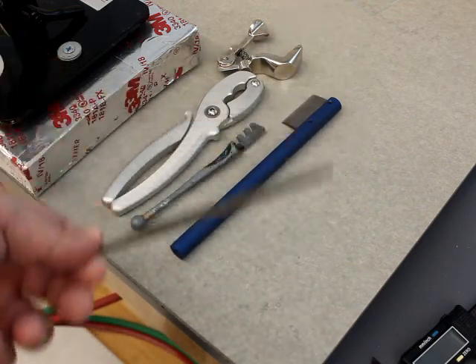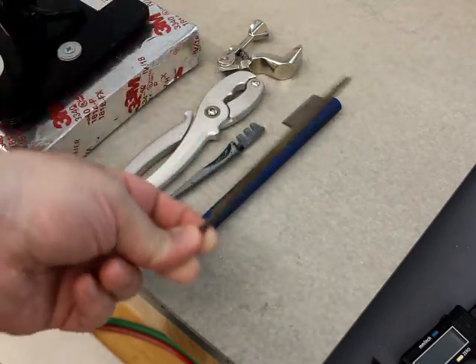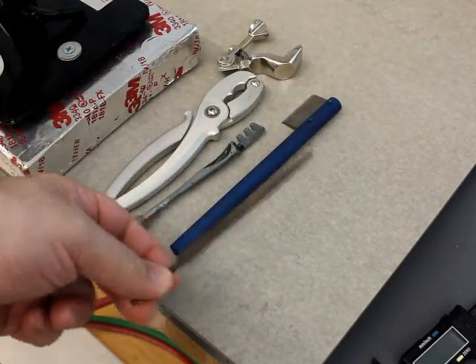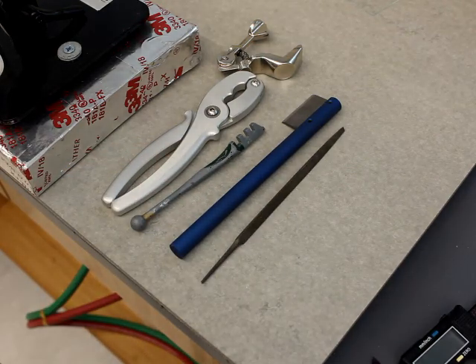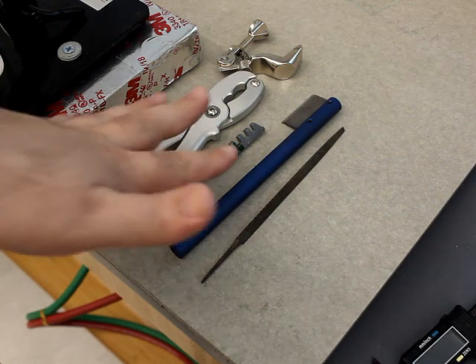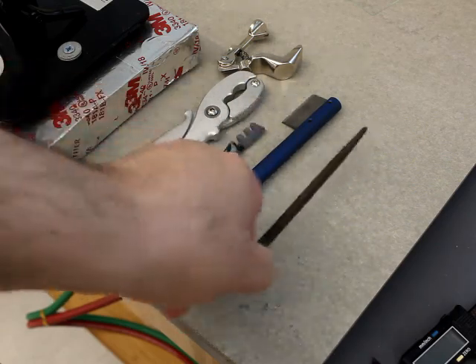My recommendation if you're a chemistry student: practice with the triangle file, because the other glass cutting tools just might not be available. Keep in mind that sometimes you simply don't have the best equipment, so you make do with what you have.